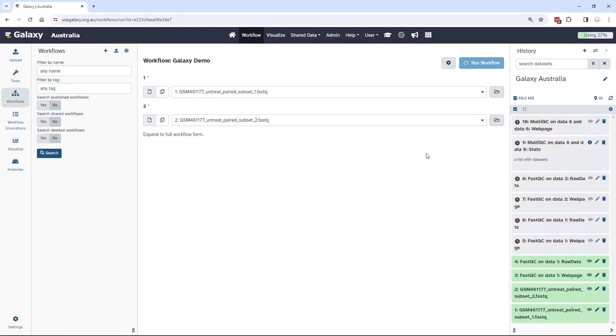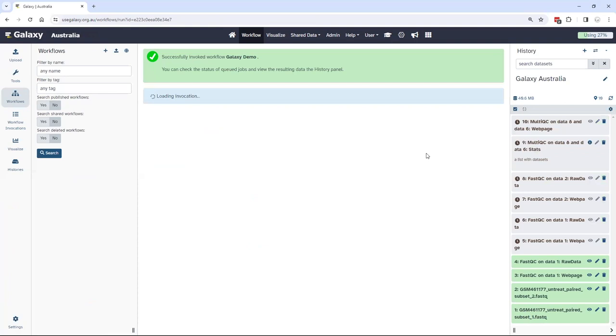As you can see here, all those jobs have been scheduled and come into my history as queued up, and the workflow invocation is loading to show me that.